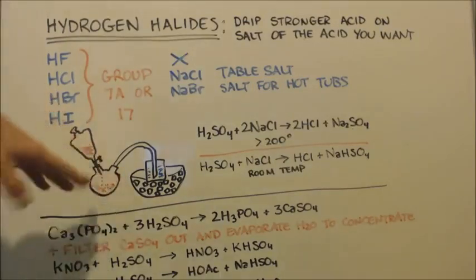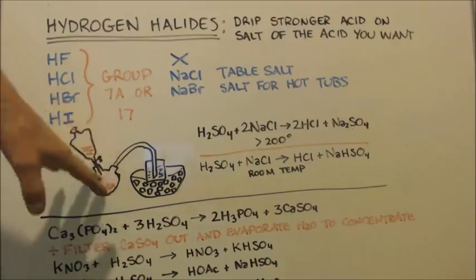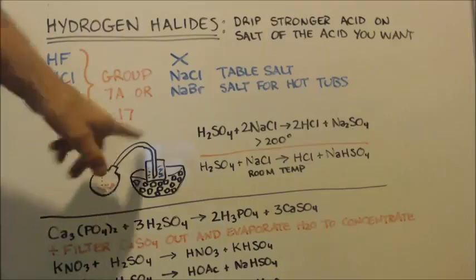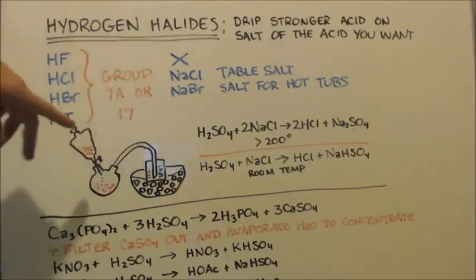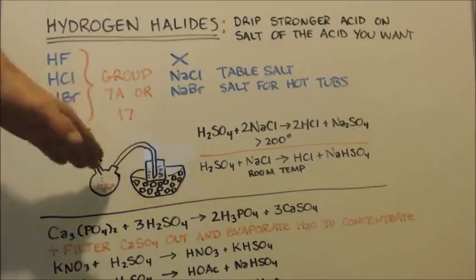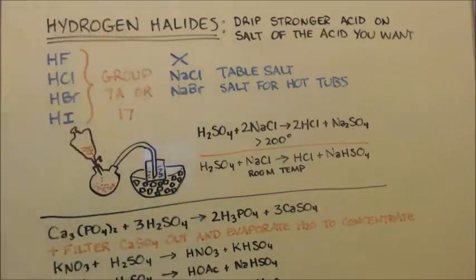So you could put water in here, and then it'll absorb all the gas, right? So you don't have to lead it into, you close this up, drip it in there, and then you can set up for distillation and distill it out as an azeotrope.